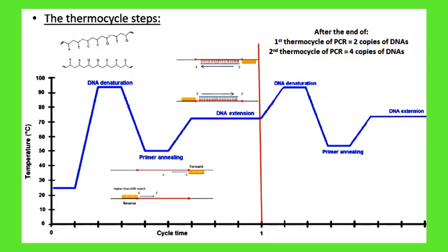At the end of the elongation step, we will get two separated copies of DNA, or two copies of a particular sequence as we need. In the normal case, we need 1 minute to build up 1000 bases.